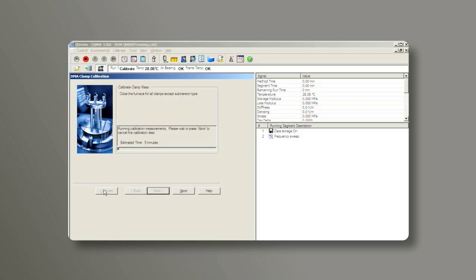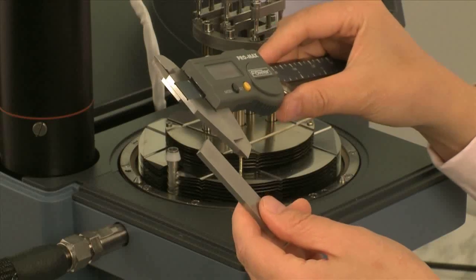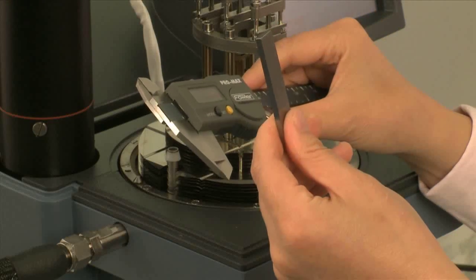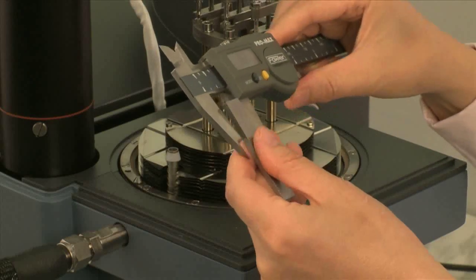This first calibration step is to calibrate the mass of the movable clamp. For clamp compliance calibration, take the steel bar from the clamp kit. Use a caliper to measure its width and thickness.